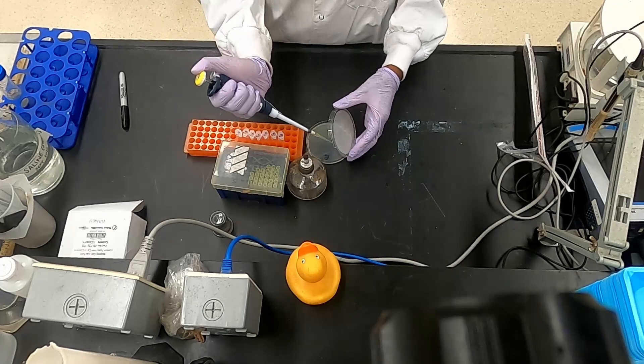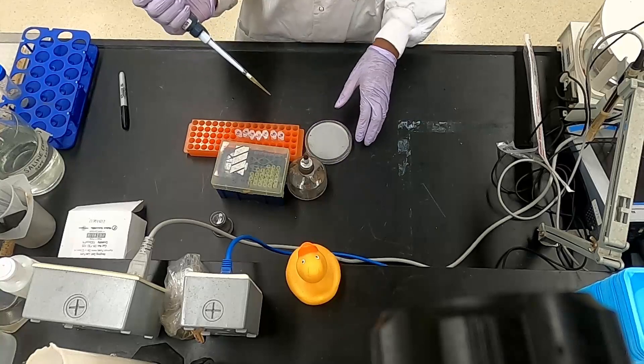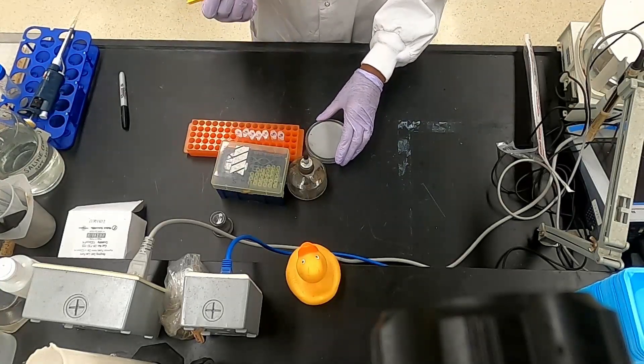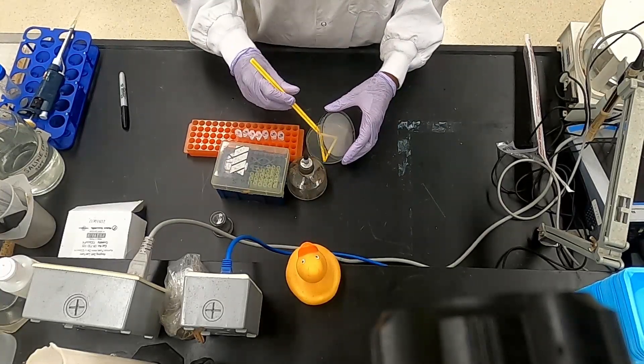A certain volume of each dilution, called the plating factor — in this case 0.1 mils — is plated onto the nutrient agar, and the plates are then incubated at 37 degrees Celsius for 24 hours to allow any present bacteria to grow and form CFU.